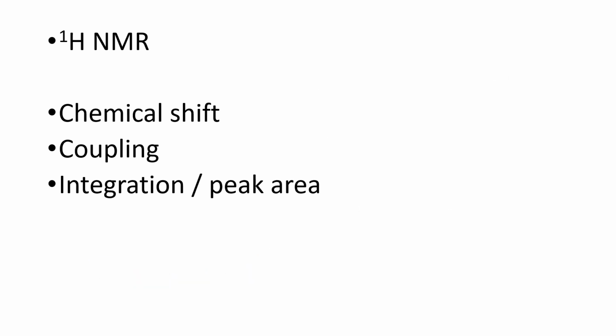The second thing is called the chemical shift. Now, when you have an NMR spectrum, it has the x-axis going along the bottom and it's in reverse, and the x-axis normally starts at 0 on the right hand side and goes through to about 12 on the left hand side. It's really weird why it's in reverse, but we don't need to worry about that. And you're always going to be supplied with a data sheet that will tell you about the different chemical shifts, but we can pretty well summarize the main areas in terms of chemical shifts because it tells you about where the hydrogens are within the molecule.